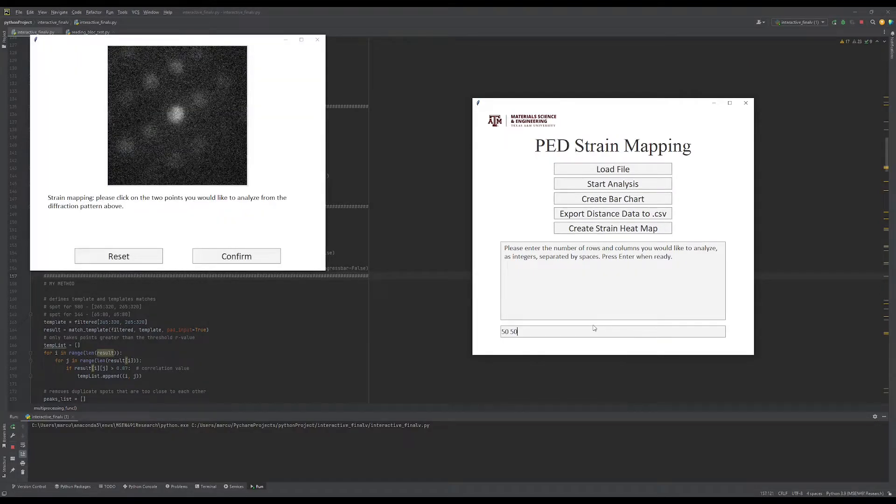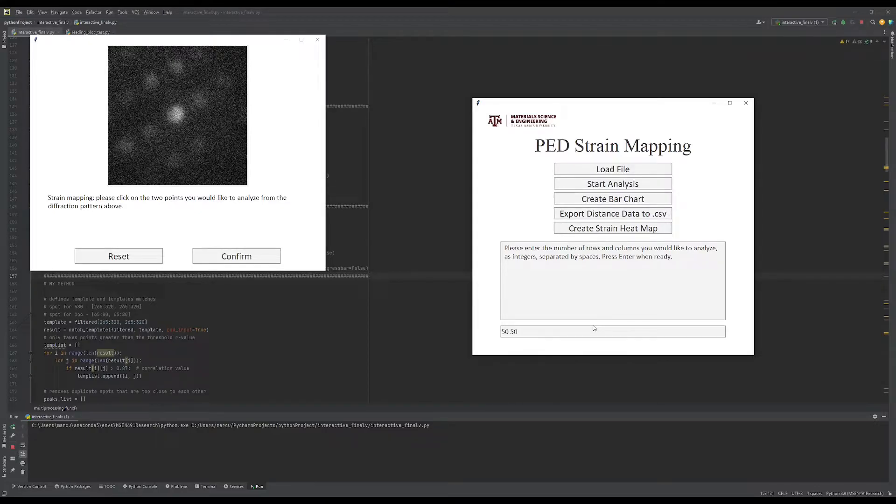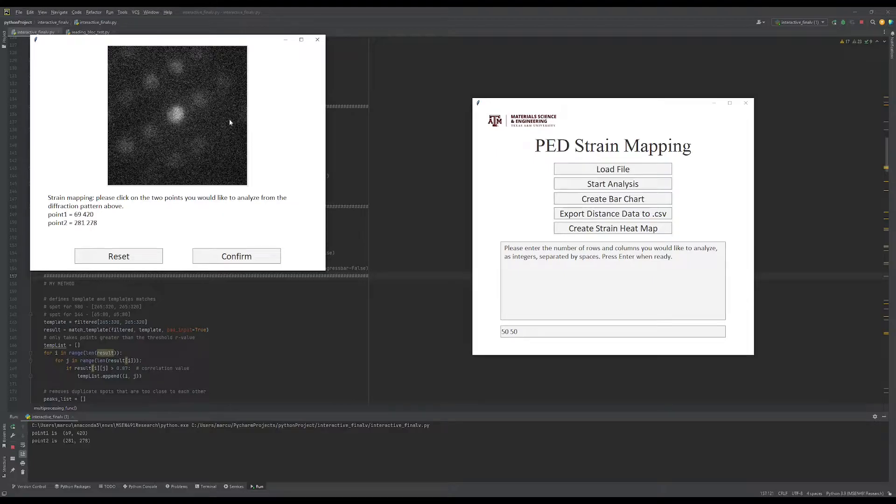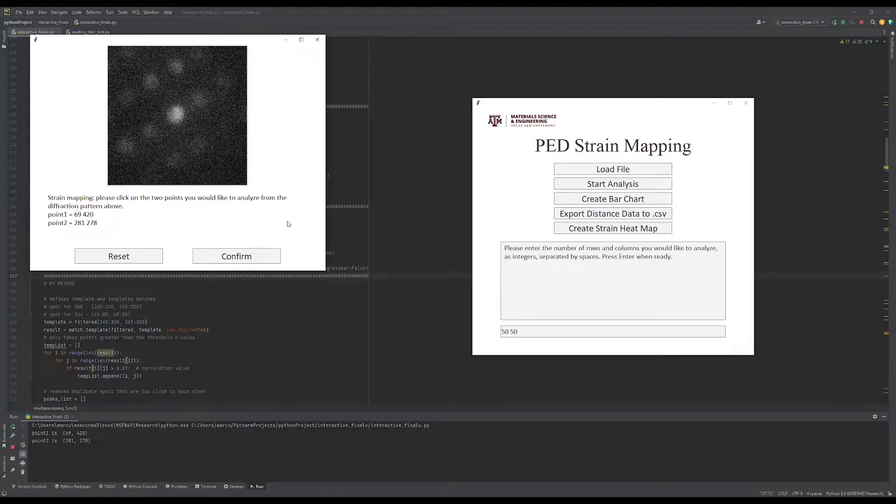A new window will pop up with one of the diffraction patterns from the data set. Select the two points you'd like to analyze the distance between. Click the reset button to select new points or confirm to start the analysis of the selected points.